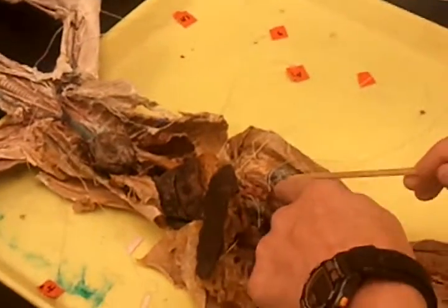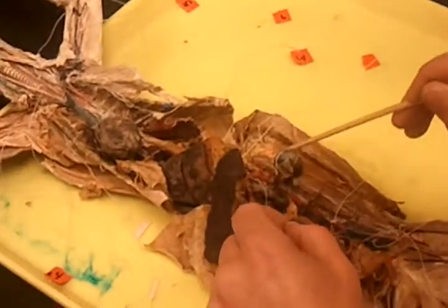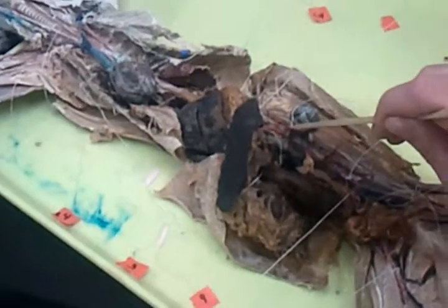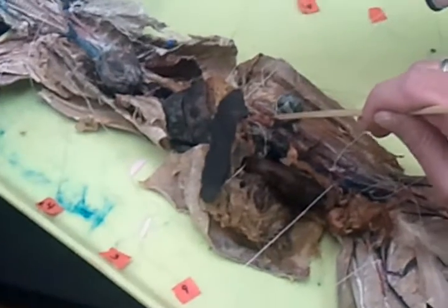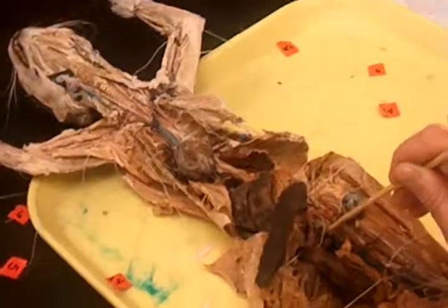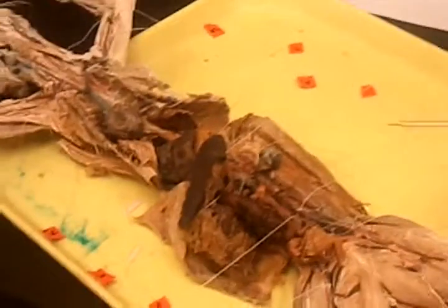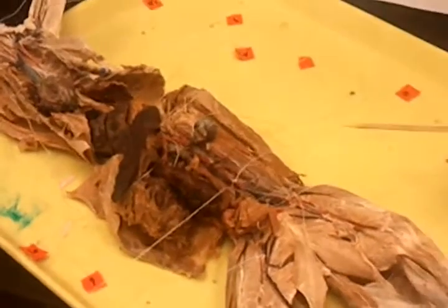Now the only guys we have to hunt for up in this region are the renal arteries, and they're going to come off like a T. So here is our dried up little cat kidney, and the string is tied around the renal artery, the left renal artery. We'd have to dig deep to find the other kidney, and that would be the right renal artery. We're not going to do the gonadal arteries on the cat.